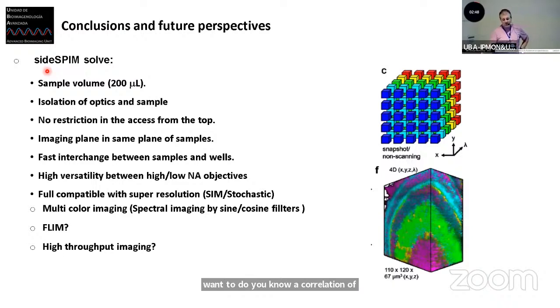And some of you may ask, why not FLIM? And yes, of course, there are people who already, you know, introduced FLIM cameras in the light sheet. We did, we never published this data, but we did put FLIM. The only consideration is you need more time, but this is a really powerful technique. And I see that with the spectral it is going to be very, very powerful for here.